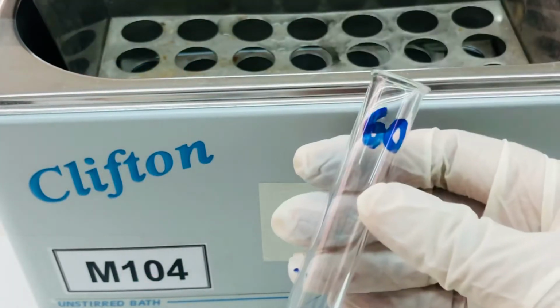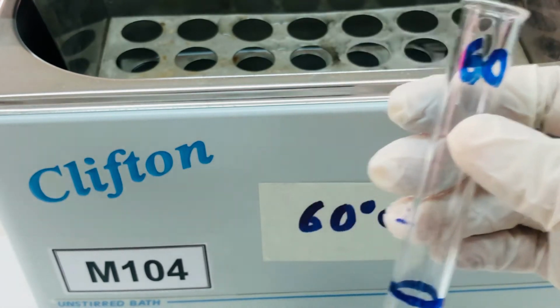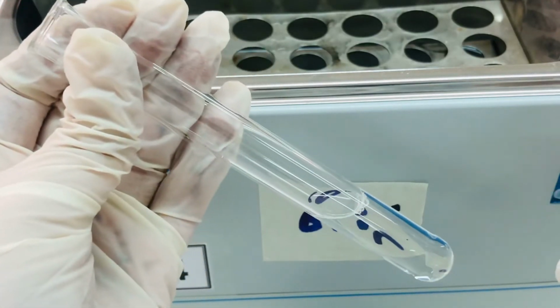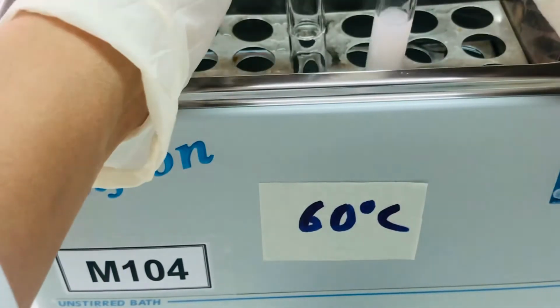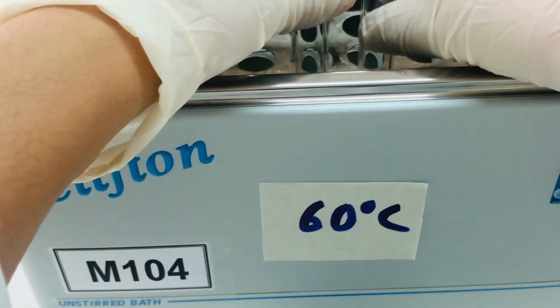We have taken this milk sample which is marked with 60 as the temperature of the water bath, and this is another test tube with 5 ml of trypsin. We are now going to place these two test tubes in the water bath for 5 minutes.